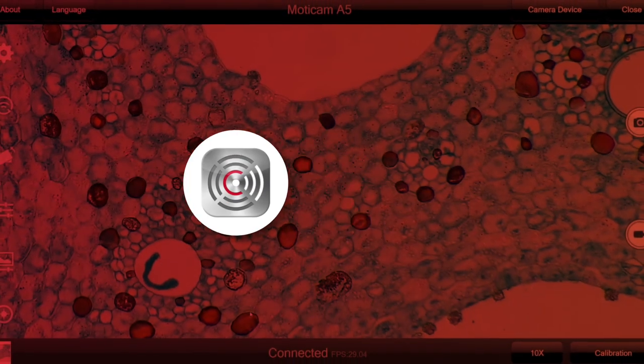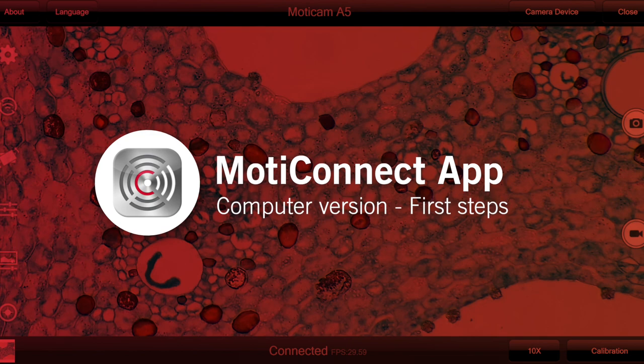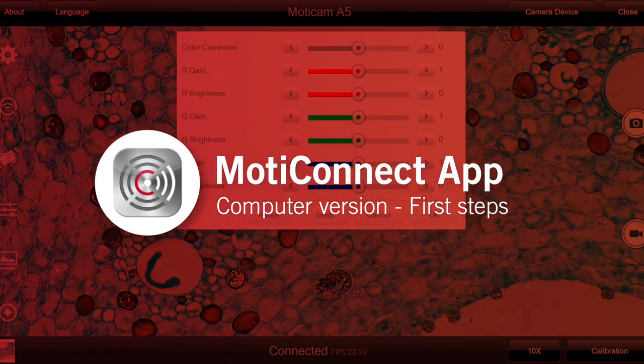Hi everyone! In this video, we will show you how to download, install and easily take your first steps in our free MotiConnect app.